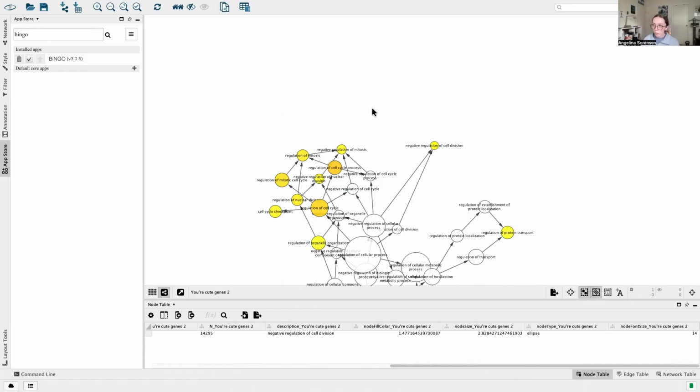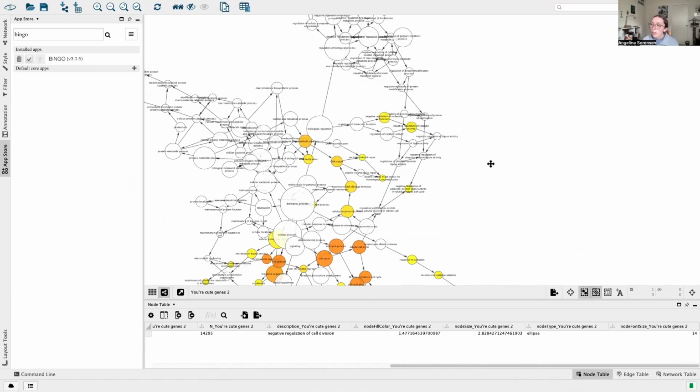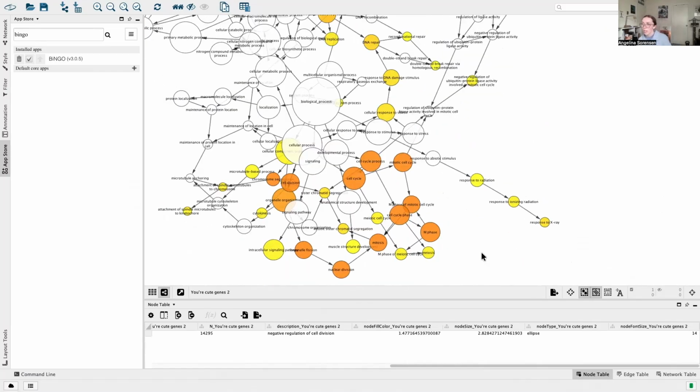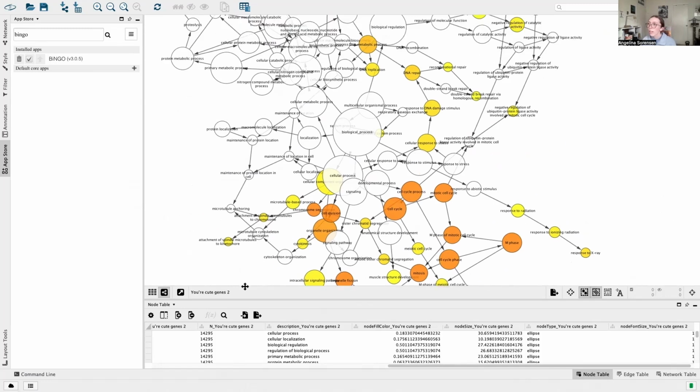So you will need a picture of this for your rationale paper. So once you zoom in on a subject or one of these categories that is meaningful to you or that you're interested in, if you want to move these around a little more so that they look a little better, that it's easier to look at.